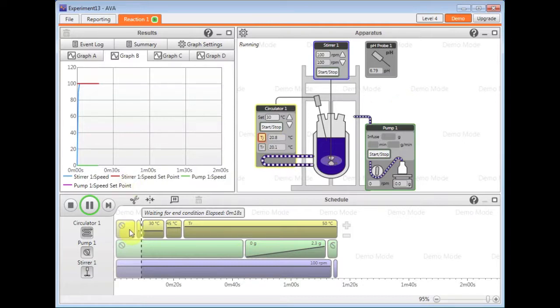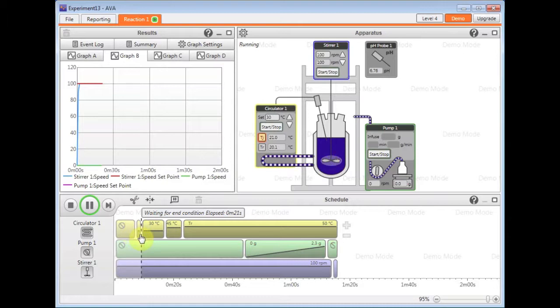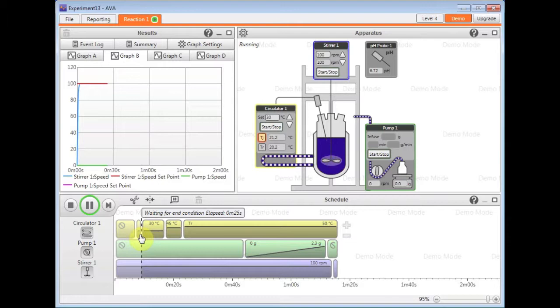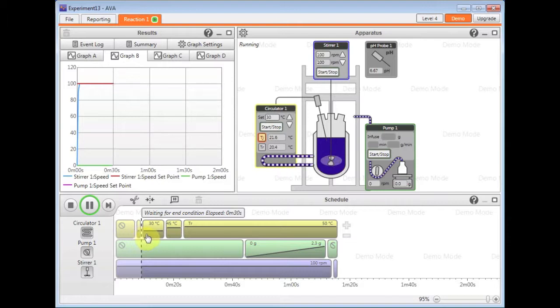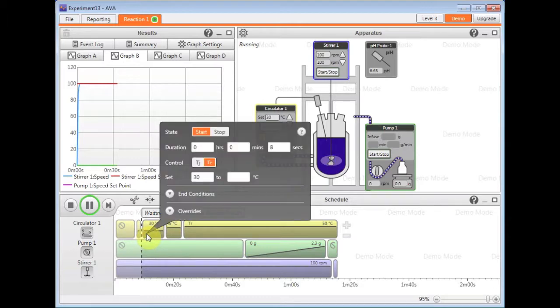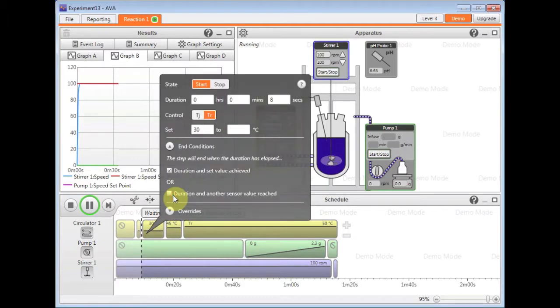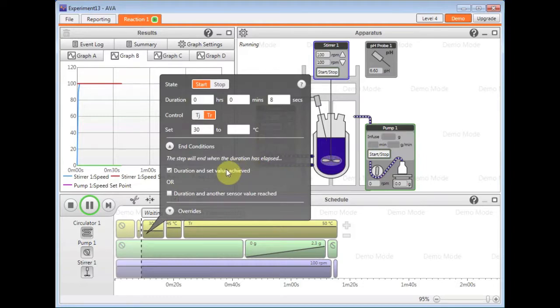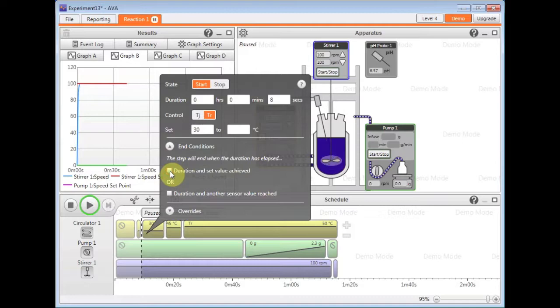As you can see here, the waiting for the end condition is waiting to achieve that value in the set box. That's the default end condition for that step. So it's always going to keep going until it's reached that value, unless I actually go into the step itself and change the end condition to basically finish as soon as the times elapsed rather than waiting for the set value to be achieved.